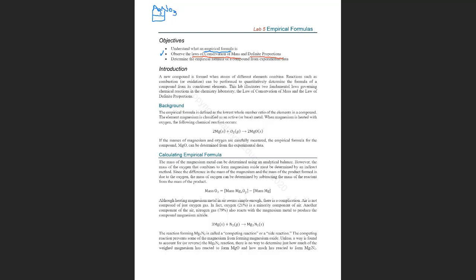And we have next to it a graduated cylinder filled with potassium chromate. We have two liquids. And I will take the mass. I will place these two liquids and their containers on a scale, and I will calculate the whole mass.